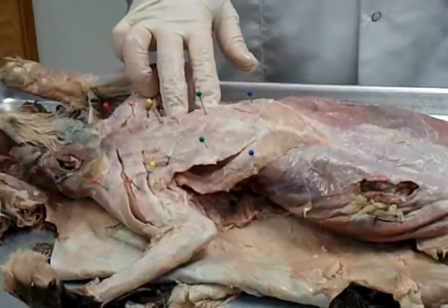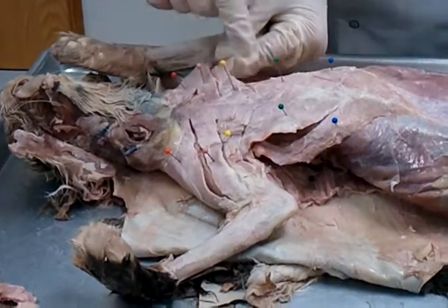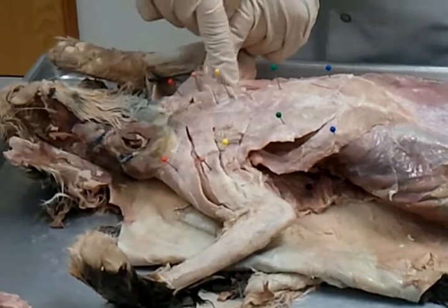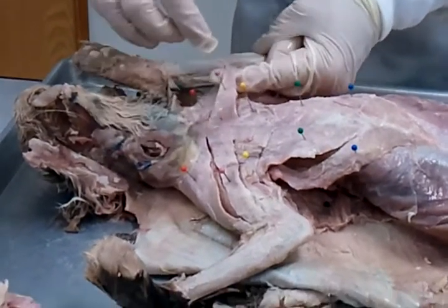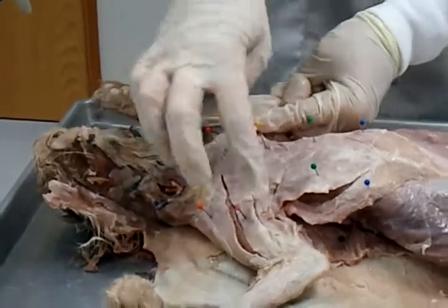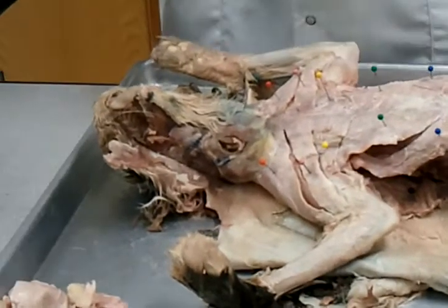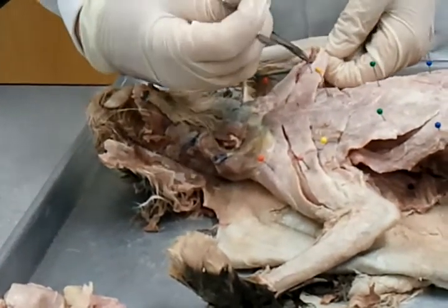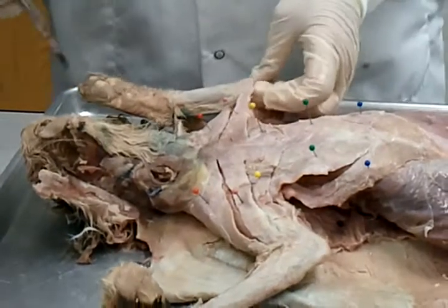Okay? Pectoralis minor. Then this one right here is the pec major, and it goes on top of the pec minor. There's pec minor under it. And then on top of that goes one from the pectoral region to the forearm. If it goes all the way over to the forearm, all the way over to here, we're going to call it the Pectoantebrachialis. You don't have that one. You don't have a Pectoantebrachialis, and you don't have a Xiphihumeralis.